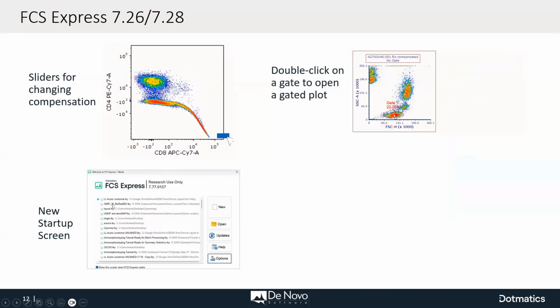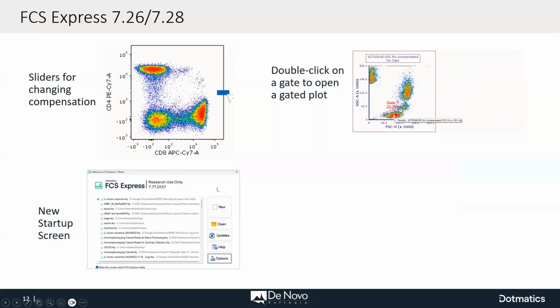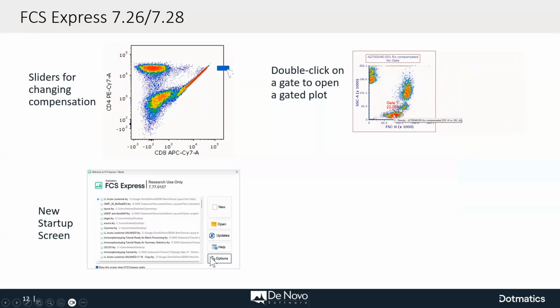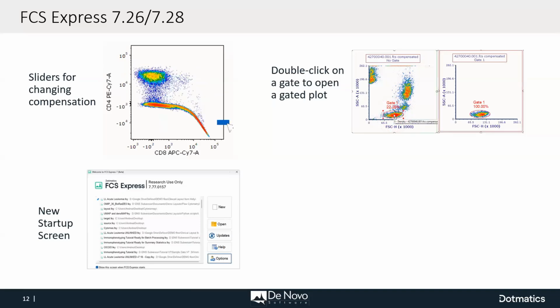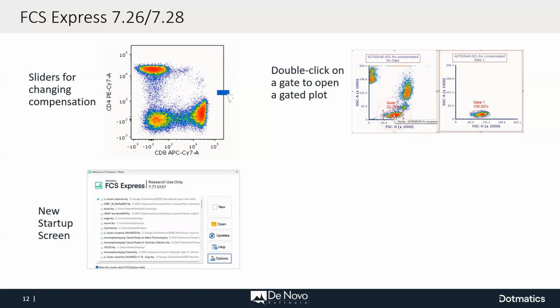This is the idea for the future: giving you the ability to access more than 4 recent layouts and fewer buttons to really focus on what's needed. And you see here options, where you will be able to access your user options. And if you are an administrator for site licenses, internet dongle or network licenses, you will have the ability to manage users directly from this dialog instead of first logging into the website or loading FCS Express and going to file, security, and so on.